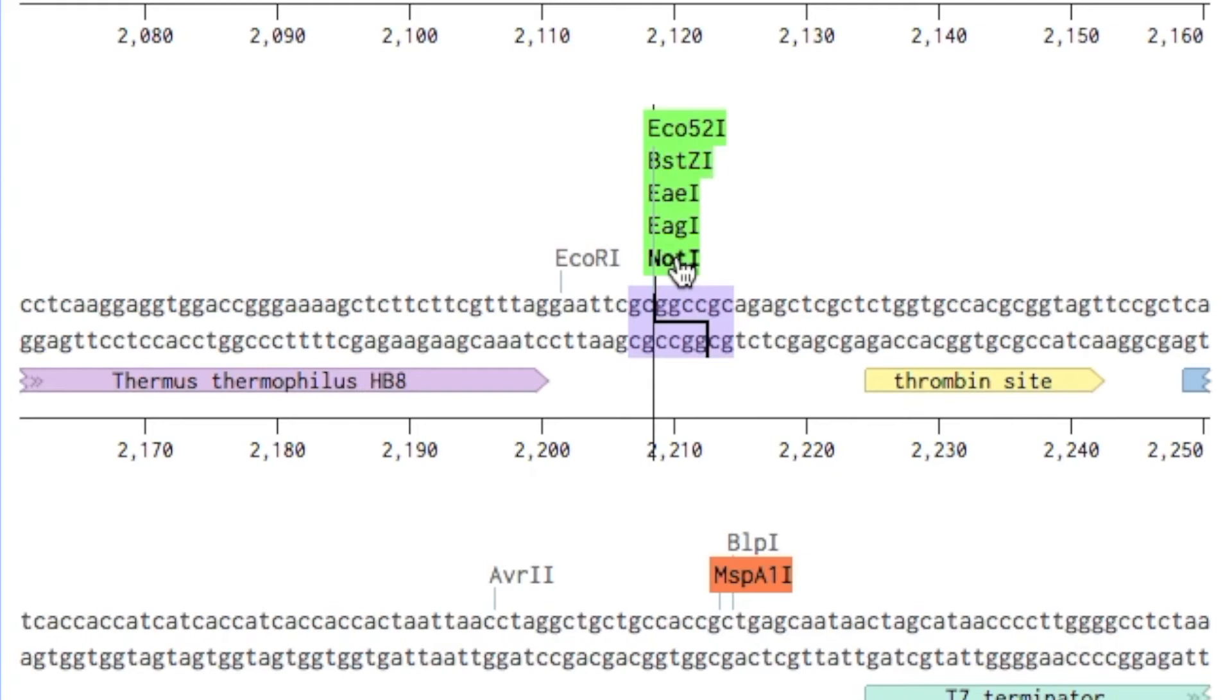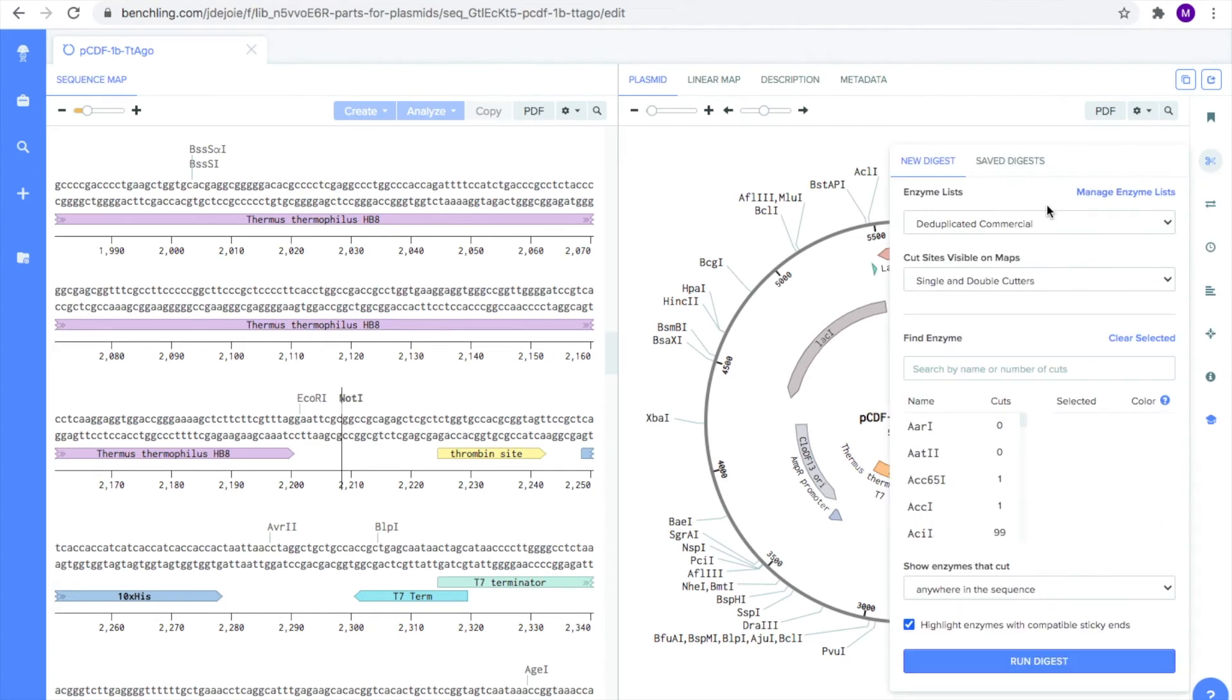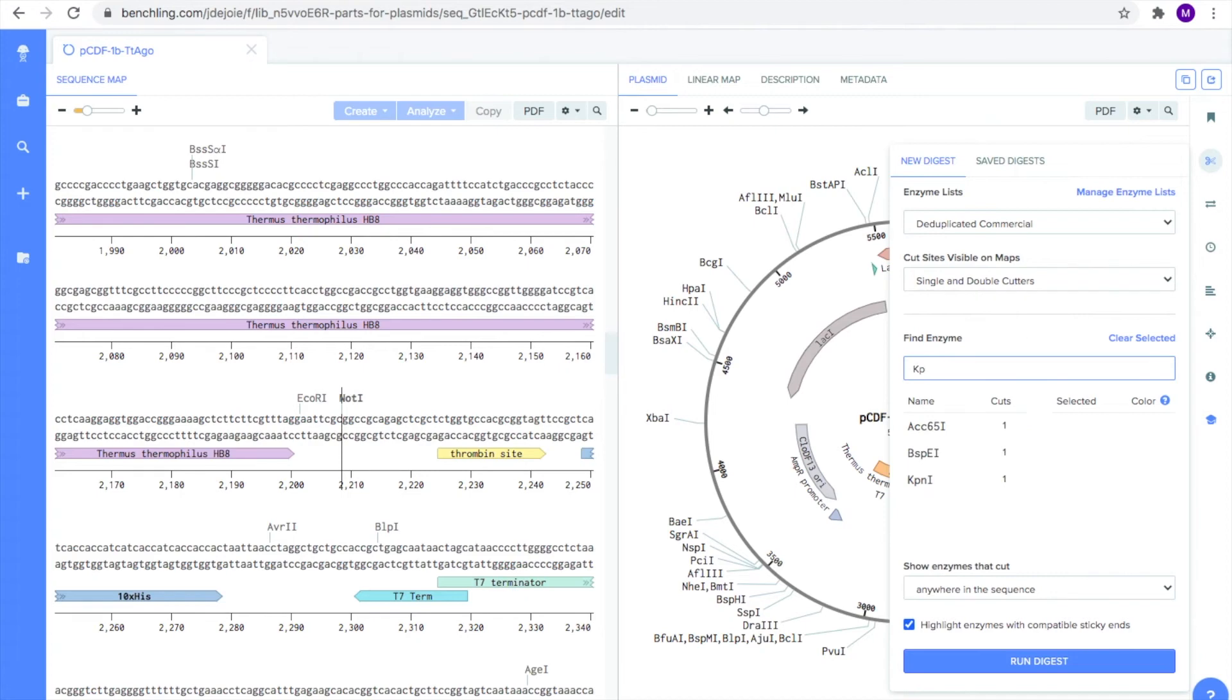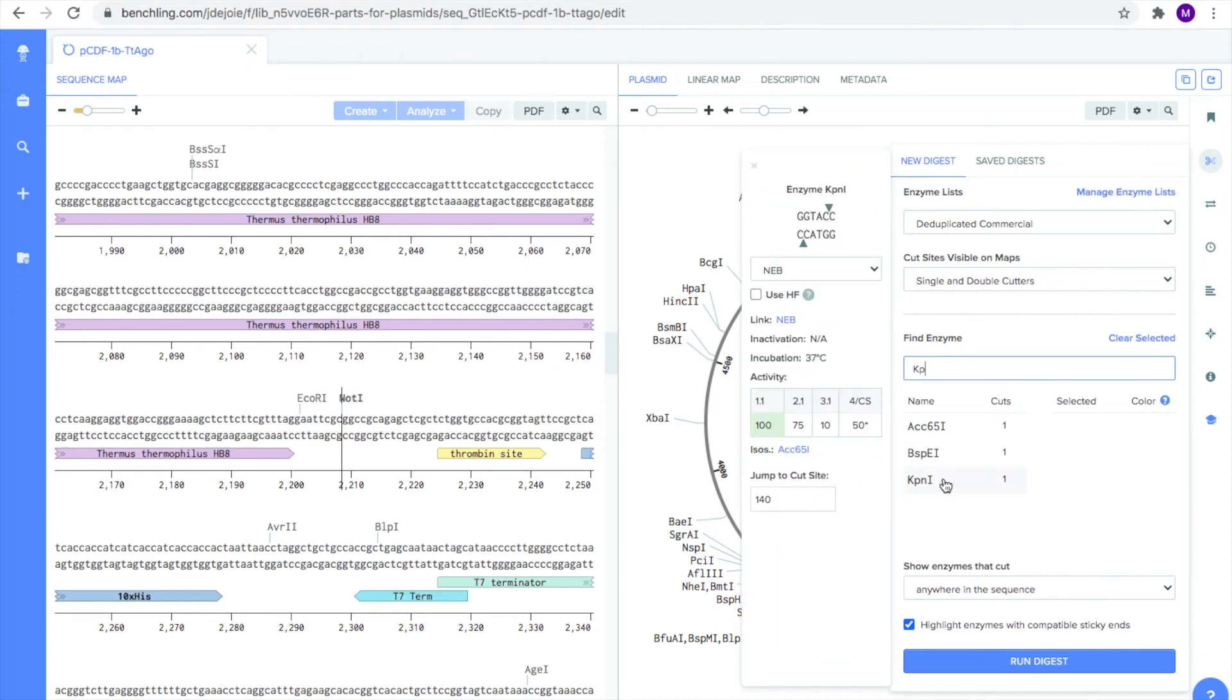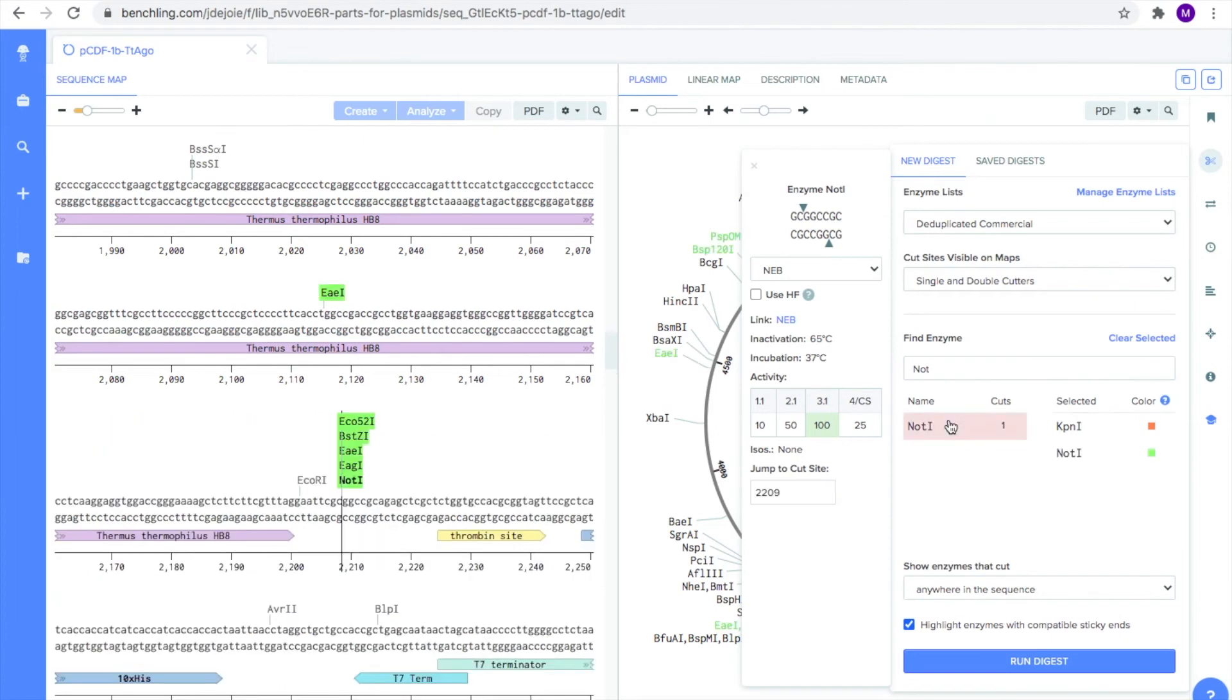Now that we picked our enzymes, it's time to run a digest. To run a digest, click on the scissor icon on the right-hand panel. Under New Digest, scroll down to the Find Enzyme search box. First, we are going to type in KPN1, and we are going to click on it. Then, let's type in NOT1 and click on that. Notice how each restriction enzyme is assigned a color that will help you identify the restriction site location on the sequence map.